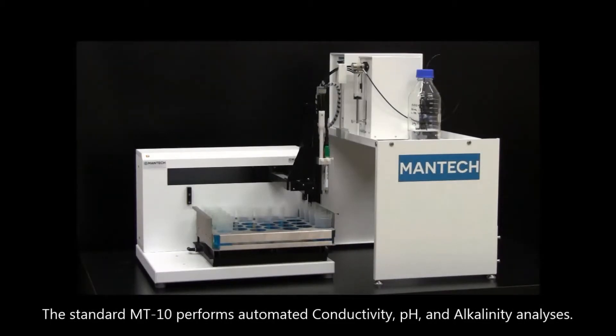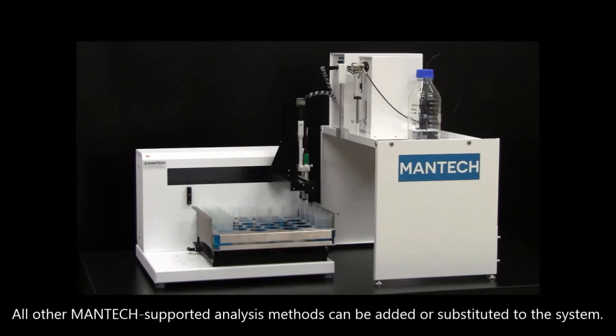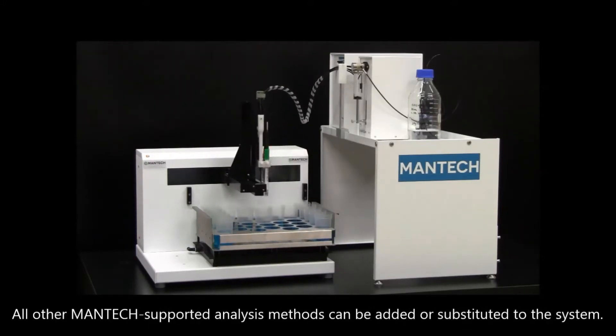The standard MT-10 performs automated conductivity, pH, and alkalinity analyses. All other Mantec-supported analysis methods can be added or substituted to the system.